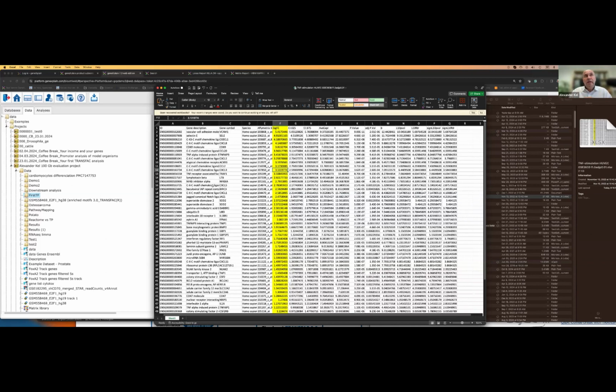And basically, we did this in the platform, but today we are not showing how to find differentially expressed genes and reveal upregulated ones. These are all in the pipelines we have in the platform. But today we're starting just from a given gene list. So suppose you did this yourself using separate tools or anything you like, and then you have this set. So you want to upload the set into the system and predict transcription factor binding sites for the promoters of these upregulated genes. All right.